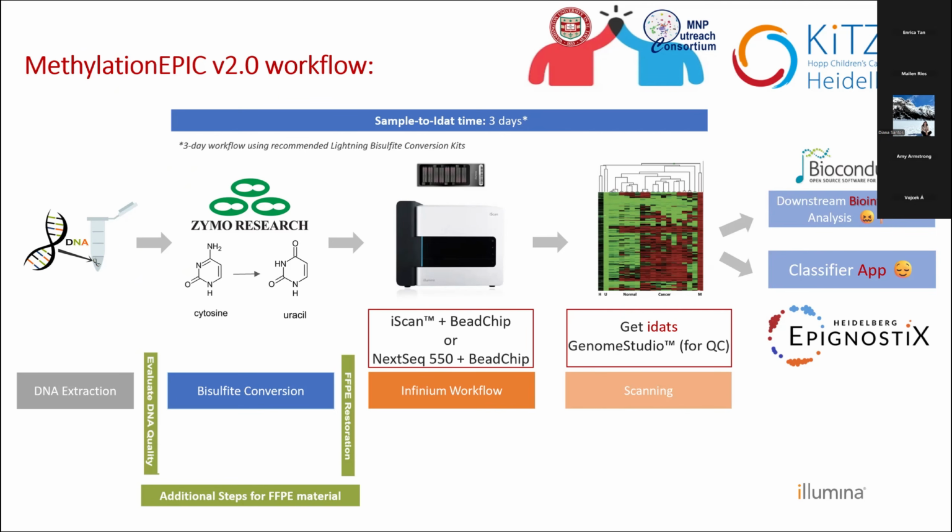Yeah, this is a very good question. Part of it is because of the batching, of course, because the bead chip that you see here is already designed to accommodate 8 samples at a time. In addition to that, some of the reagents that come with the kits are designed for 16 samples or 32 samples, and they have an expiry date of around 2 weeks. So once you open the reagent, you need to consume it within 2 weeks for 16 samples.